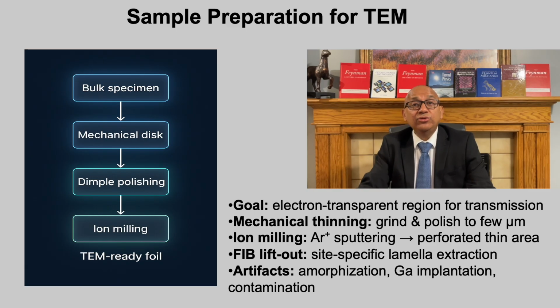As milling continues, a small perforation forms, creating an electron transparent window near the edge of the hole. For targeted analysis, such as a device interface, grain boundary, or nanopillar, researchers use focused ion beam, FIB, lift out. A dual beam SEM-FIB system allows cutting, extracting, and mounting a thin lamella precisely from the desired location.